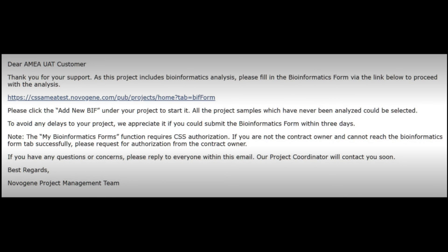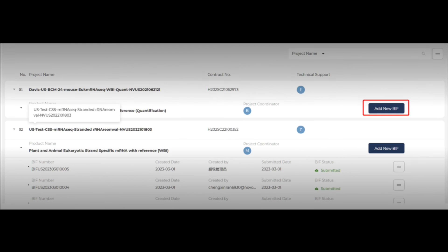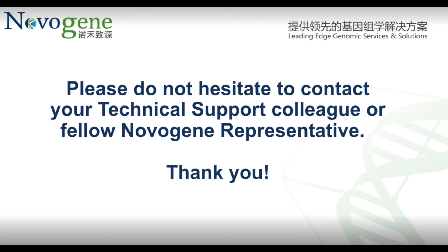If you reply to the library preparation and sequencing order by email, our lab will perform the sequencing order and send an email to you to fill in the bioinformatics form. Please click the link in the email to enter the bioinformatics form page on the CSS system. Click add new BIF to create the online BIF and complete the same steps as previously mentioned in this video. This is the full process of the online bioinformatics form. If you have any questions about this, please do not hesitate to contact our technical support colleague or fellow Novogene representative. Thank you.